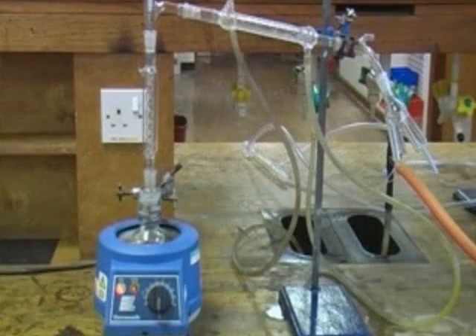Fractional distillation is used to separate a mixture of liquids which typically have boiling points which differ by only 25 degrees or less.